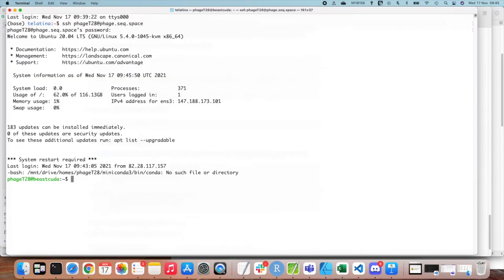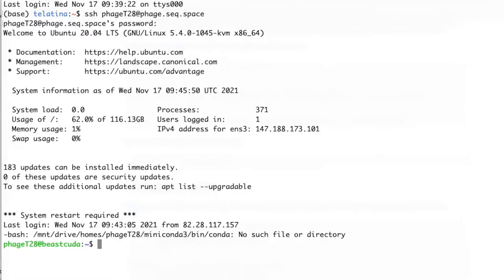Now, this is a splash screen and it's absolutely normal to see this information on this server. We can start typing our first command — for example, 'clear' — to remove the text from the screen.